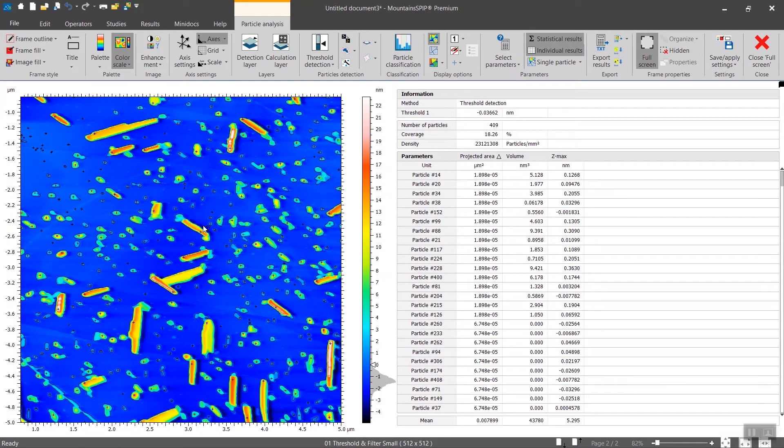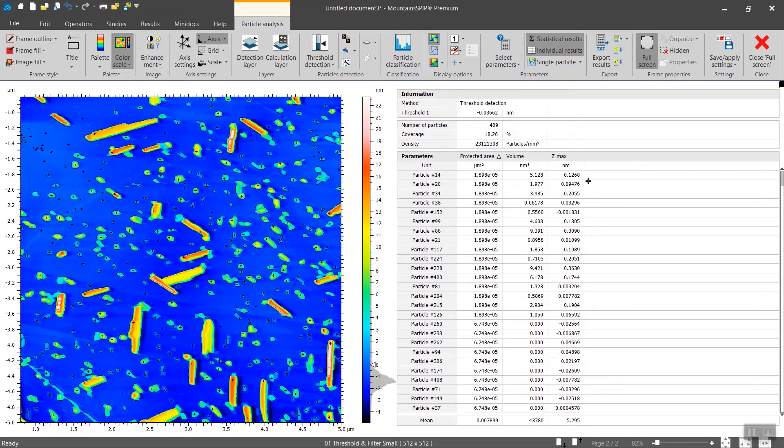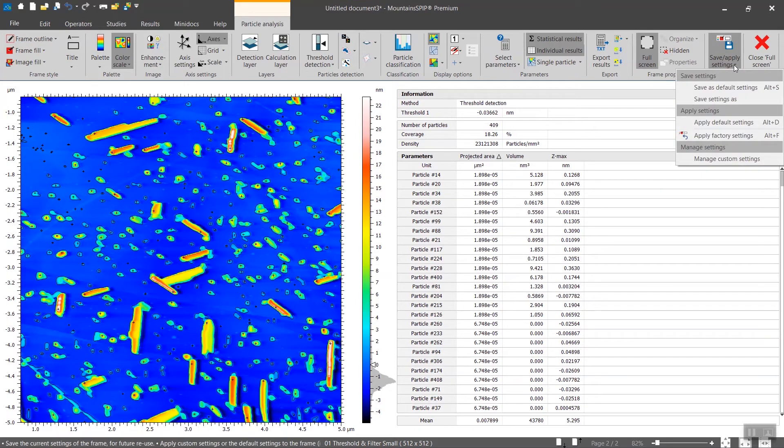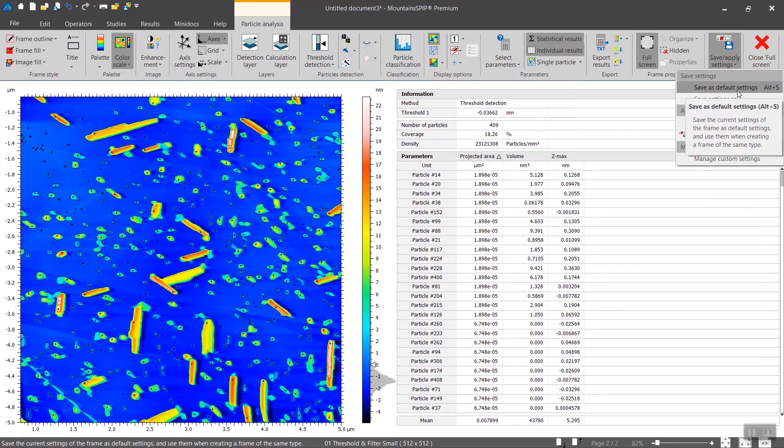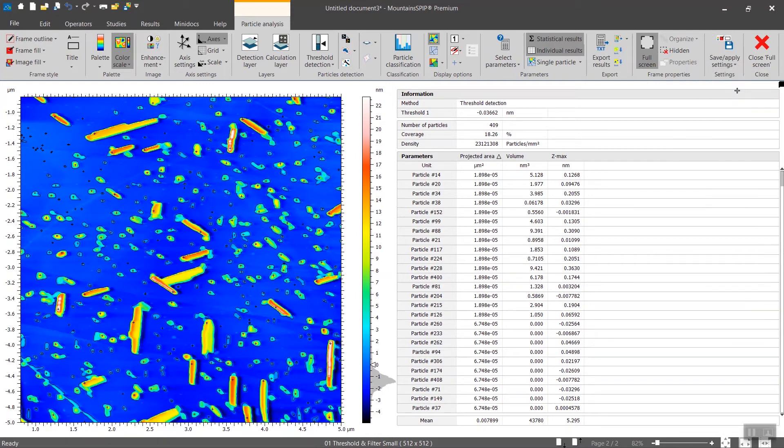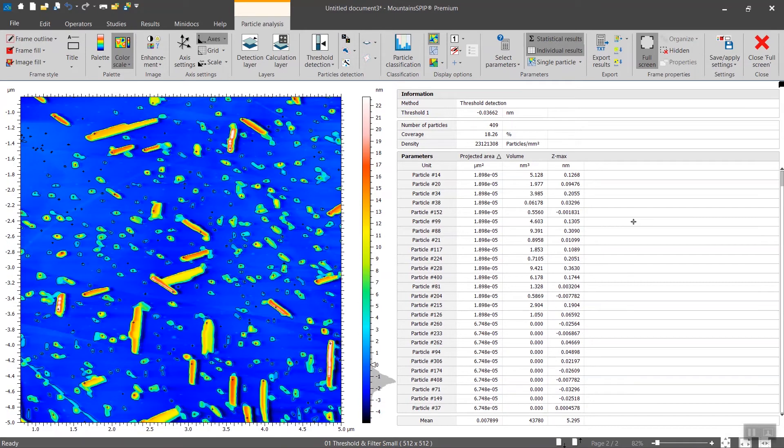If you are happy with the general layout of the study, meaning these settings here and the table of results on the right, you can save that as preferences. To do so you click here: save as default settings. Any of the other particle studies that you will be doing afterward will be displayed in the same way.